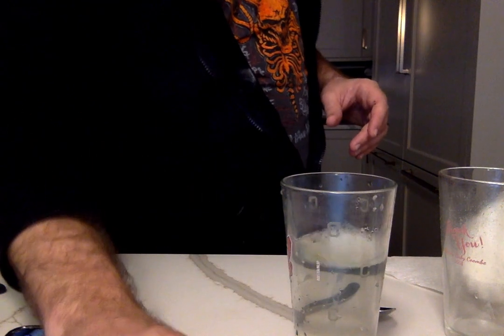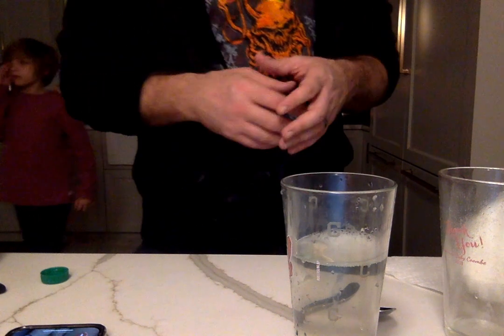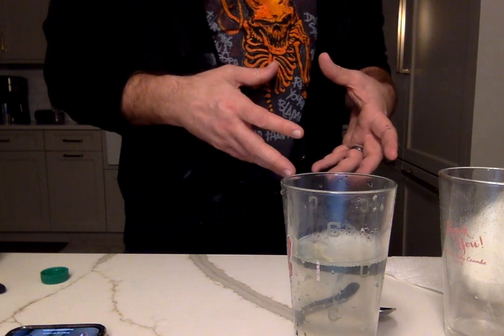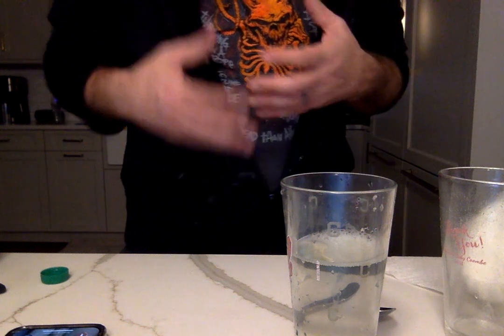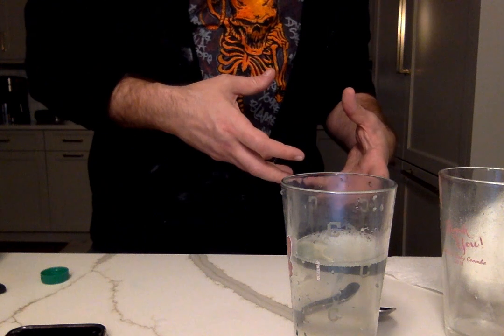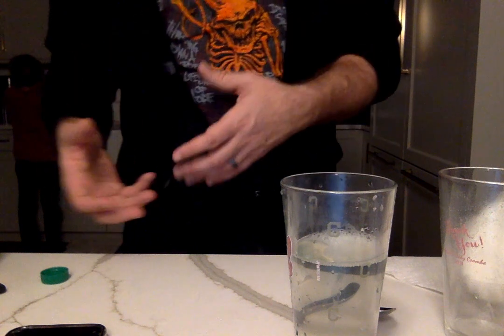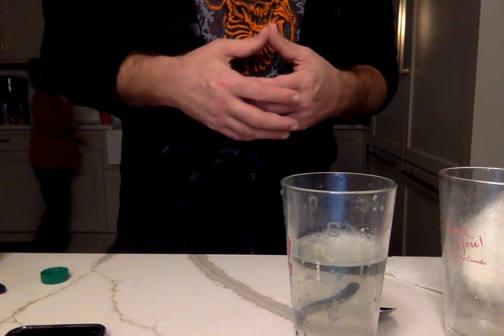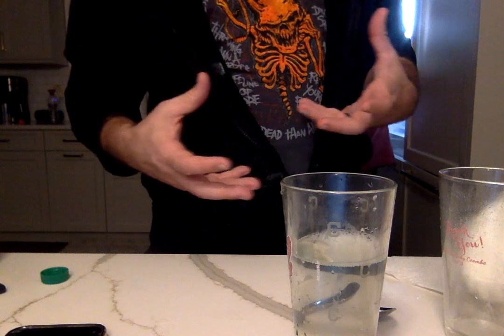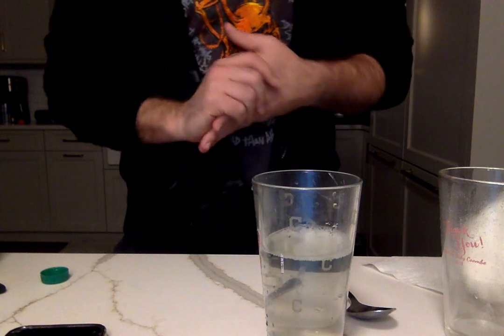When these two solutions are mixed, it's not just one reaction that's happening, it's two. They're competing reactions, pushing each other back and forth. The hydrogen peroxide wants to oxidize the iodide, I minus, back to the colored I2. But the ascorbic acid wants to bring that I2 back to I minus. This reaction happens really quickly, and the I2 doesn't last very long and is extremely transient. That hasn't happened yet, so we'll see if it does.